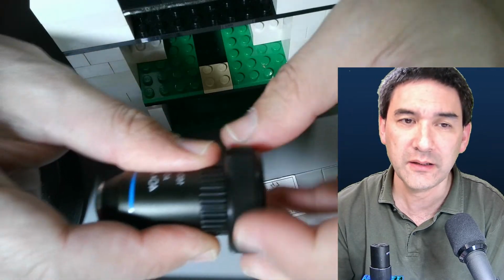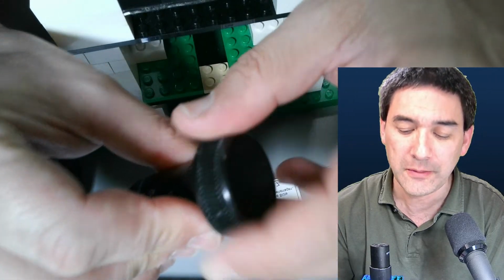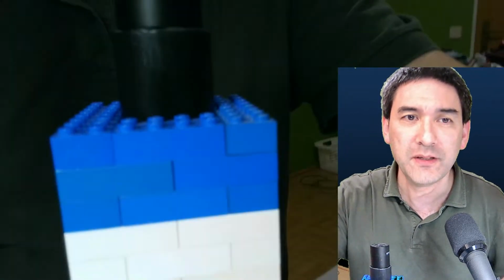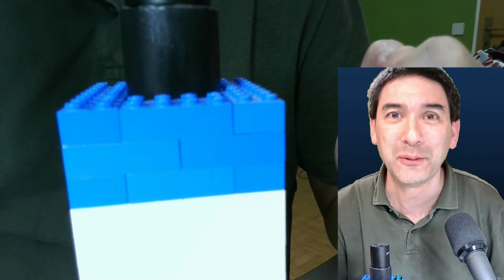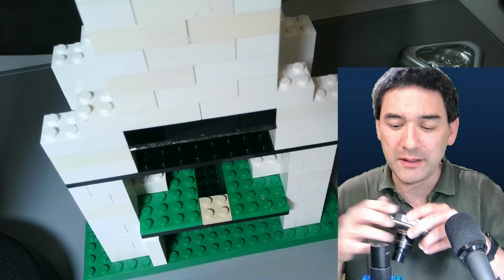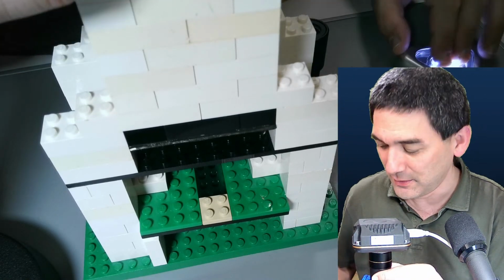When they're in here, there is a little screw-on cap, and all I did is I drilled a hole here, and I also glued it on the piece of plywood, and that's basically it. And if the distance between the objective and the eyepiece is correct, then you're going to get an image. It's really that simple. So this Lego microscope is a little bit a proof of concept that it doesn't take a lot of effort to actually make something like this.